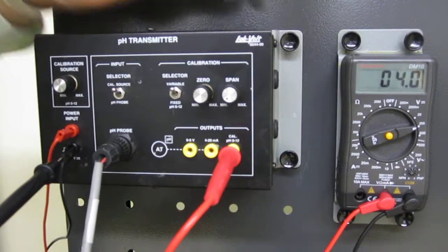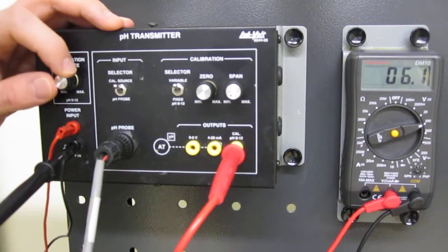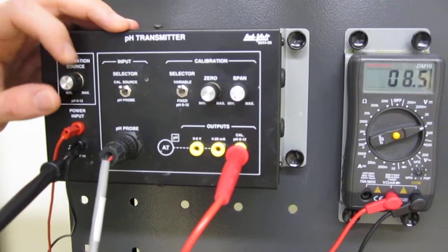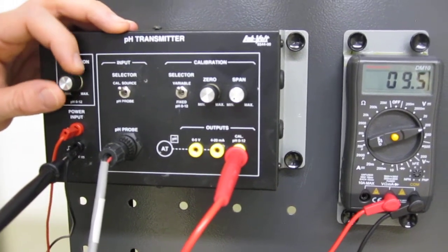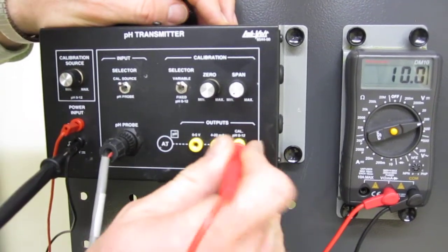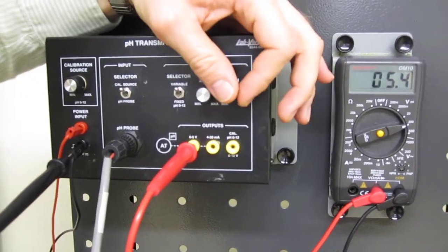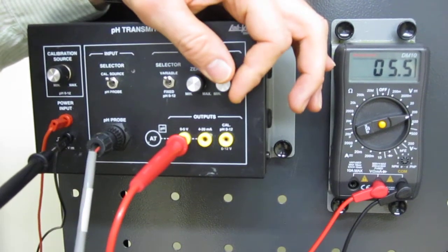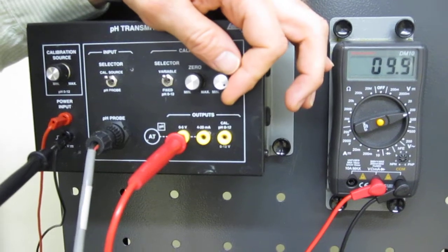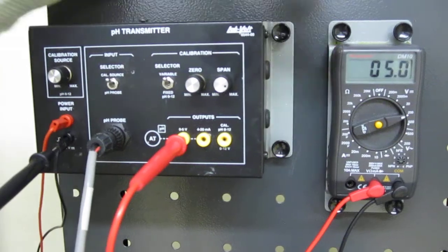I go back to my calibration probe and go up to pH 10. I go back to my jack from 0 to 5 volts and now I have to correct my span. This should be 5 volts. And now we have calibrated.